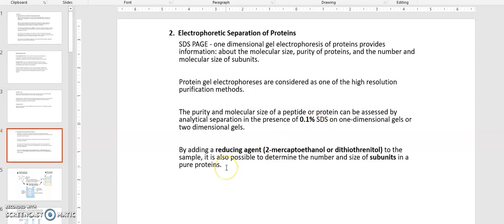And when you denature your proteins with SDS, not only do you add SDS, you also add something called a reducing agent. Reducing agents, remember, beta-mercaptoethanol or dithiothreitol are those reducing agents. They are added to what? To break up those disulfide bonds between two cysteines. You're adding this to reduce the disulfide bonds within your proteins.